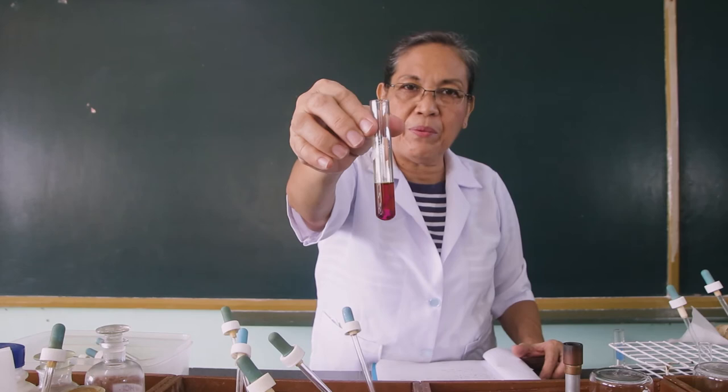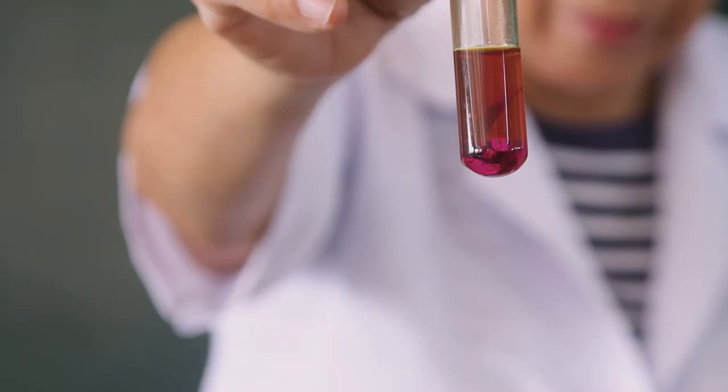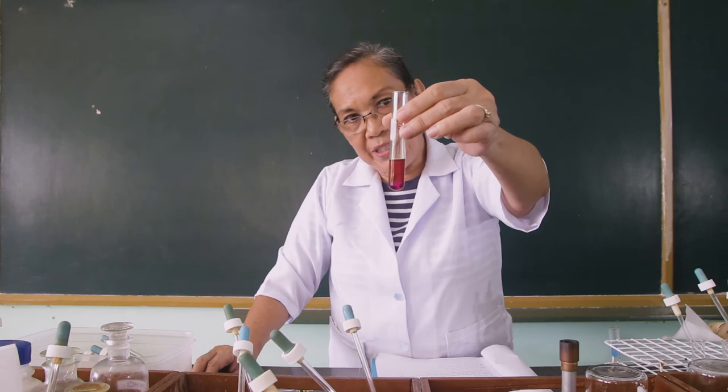Observe what happens to the lower layer of the liquid. What's the color? Then let's remove this purple color out. And let's add it with more chlorine water.